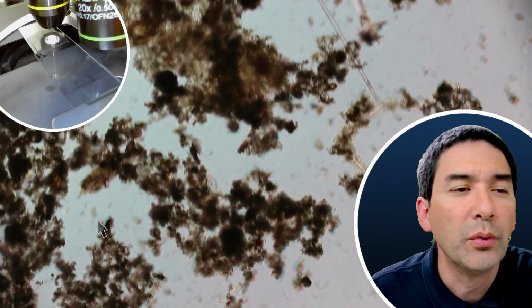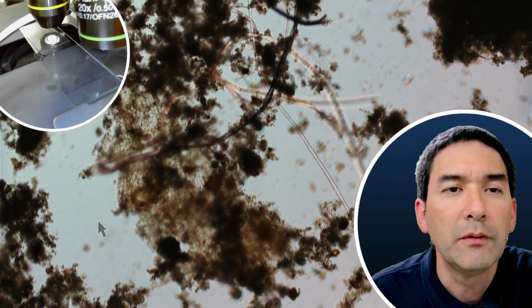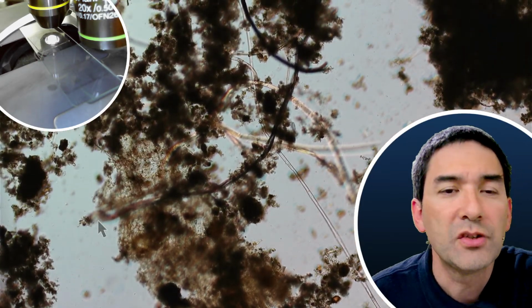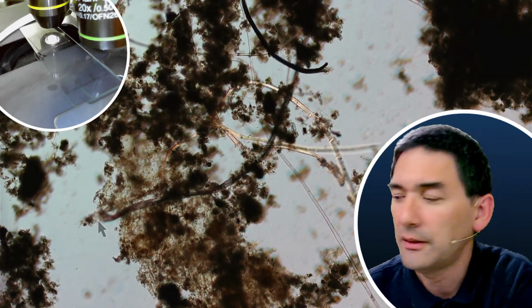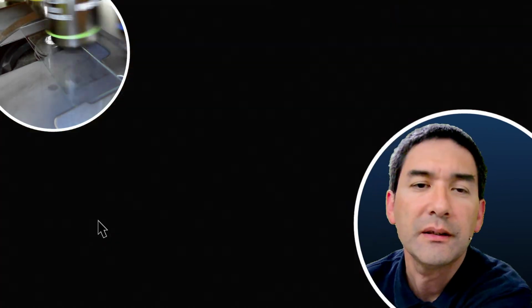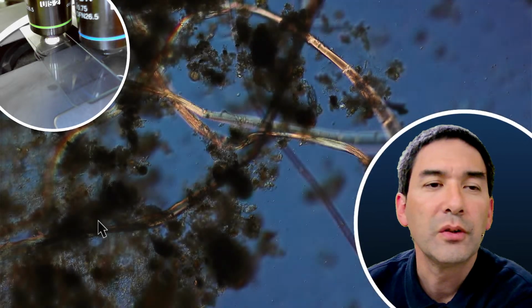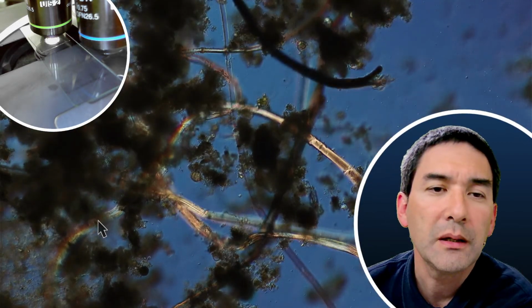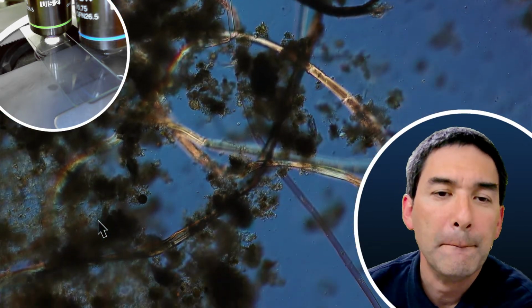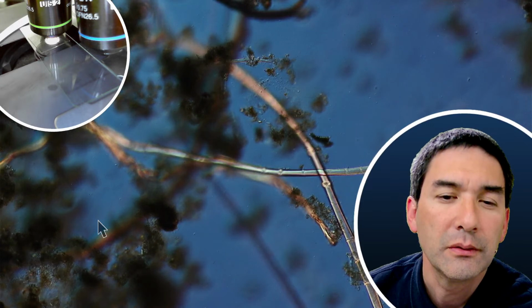As we go through the whole thing here, we're able to see a variety of unidentified structures. But something that we have here, and maybe I'm going to zoom in a little bit, is those long structures that you see here could be plant material, but I also have found some animal fur and animal hair.